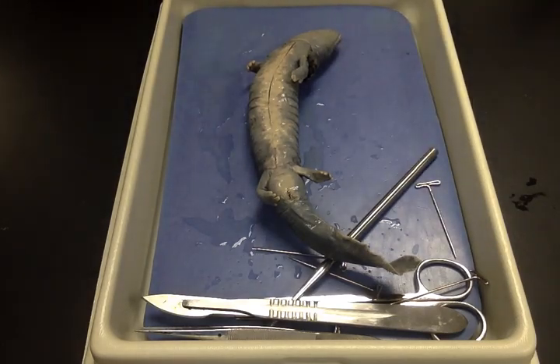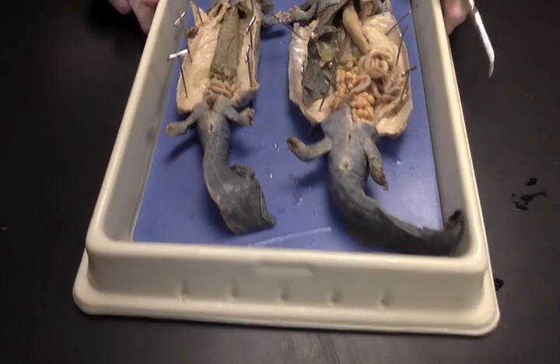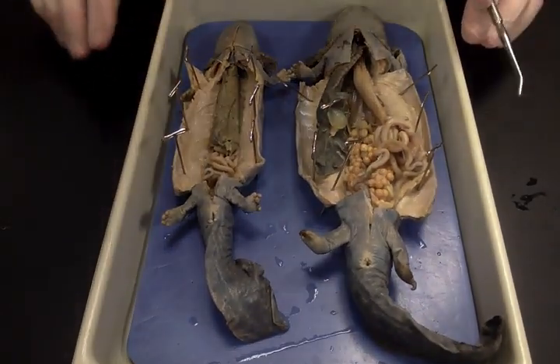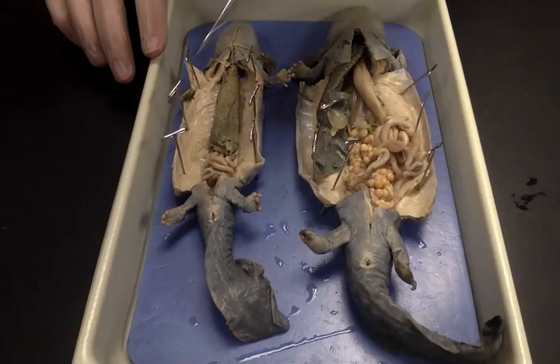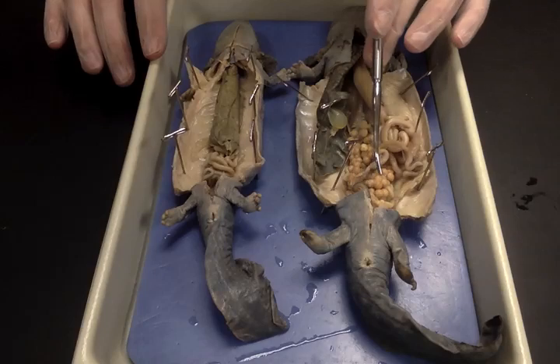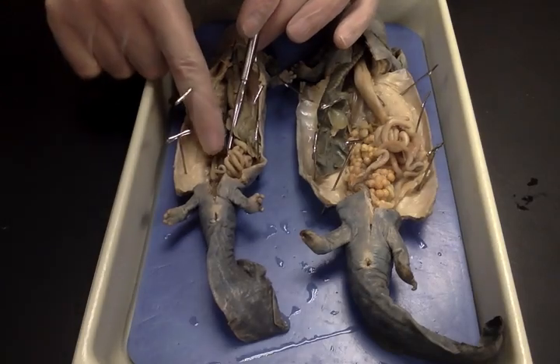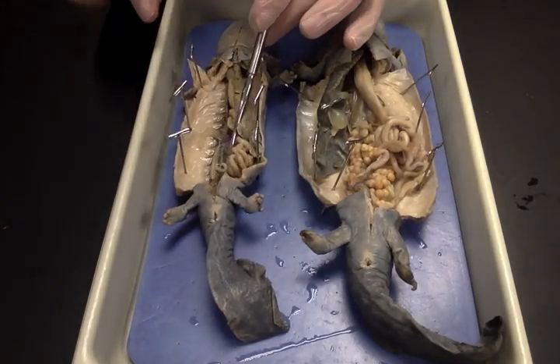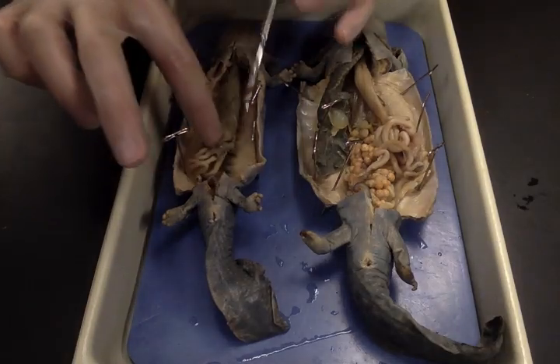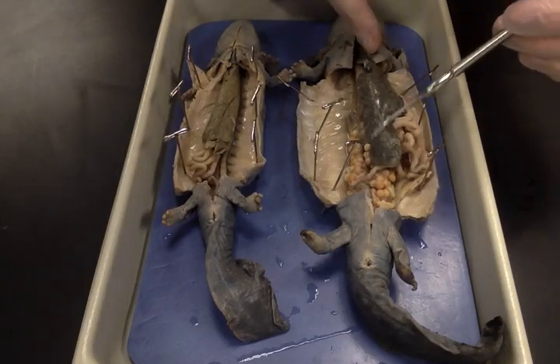Up here goes back behind the gills — that's the pharyngeal slit. That's the highlights of the external anatomy. For the internal anatomy, we have a female on this side and a male on this side. The big difference is you can see the eggs in the female, and in the male there are testes down here — one on each side.